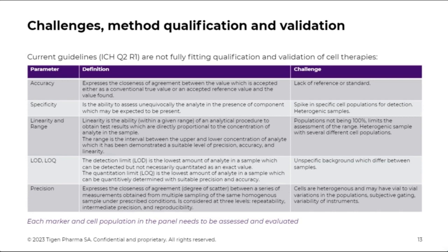And we also don't have standardized reagents all over. The linearity and the range of your assay, for example, the range is my assay is true for the data that comes out between 2 and 85%, for example.